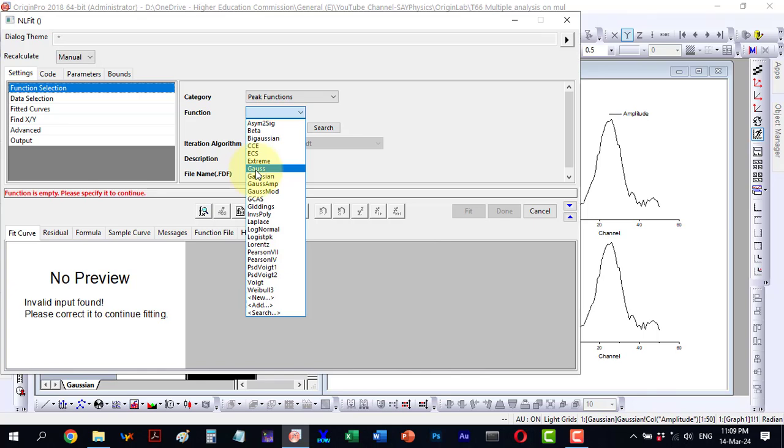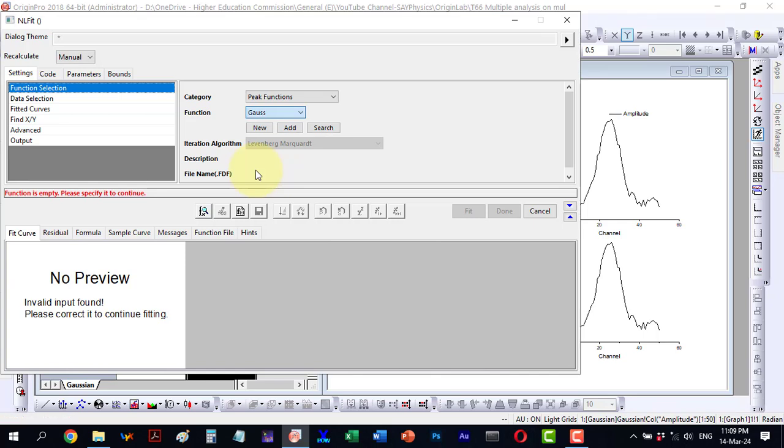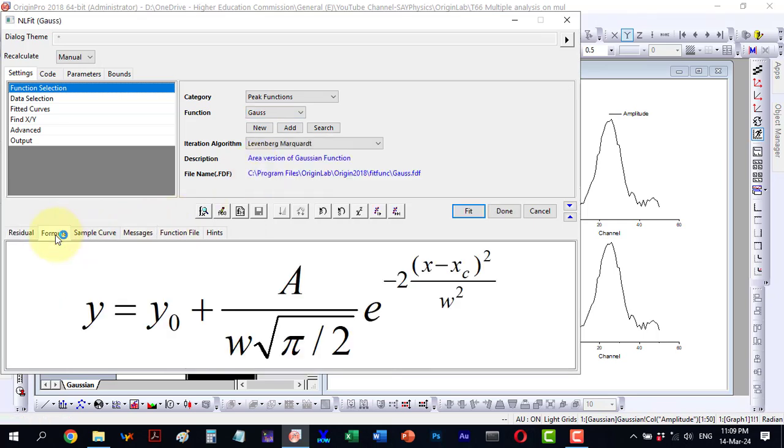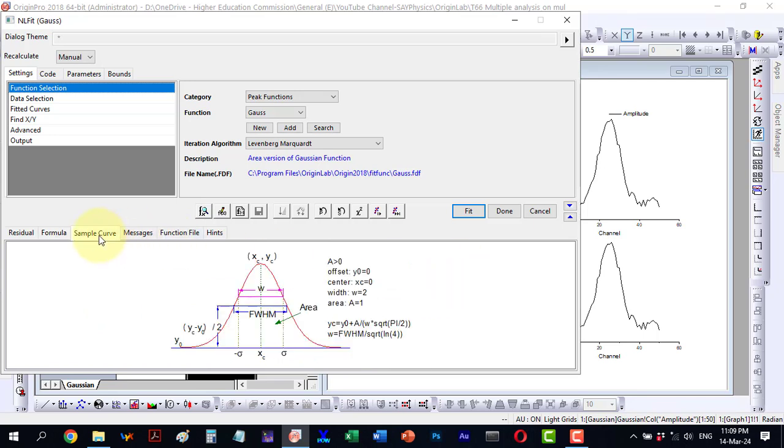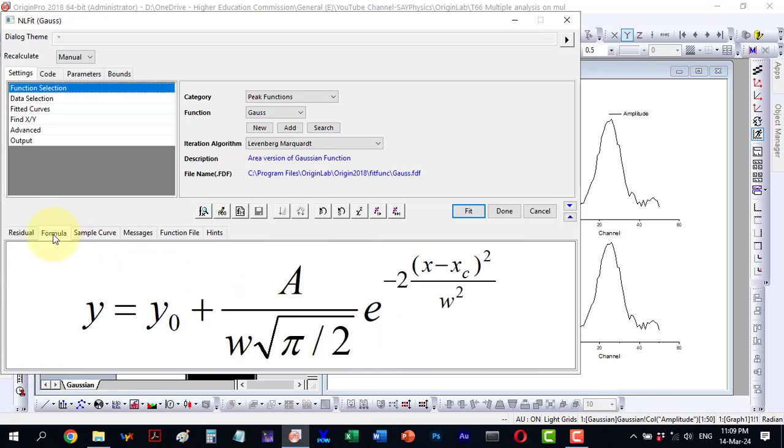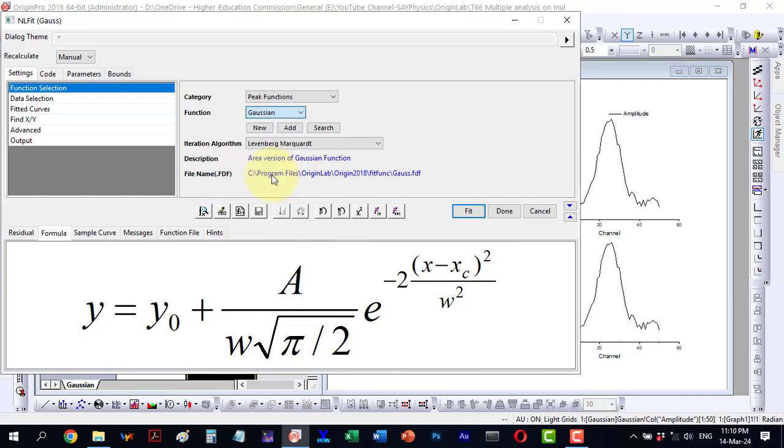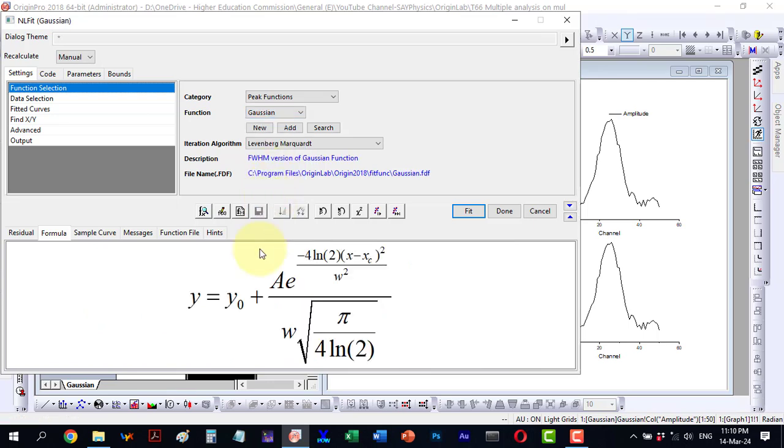Clicking on Gauss, I observe its formula which consists of y0, w, pi by 2 and others. Additionally, there is a sample curve representing it. I am particularly interested in the formula. Here is the formula for the Gauss function and here is the formula for the Gaussian function which differs significantly.